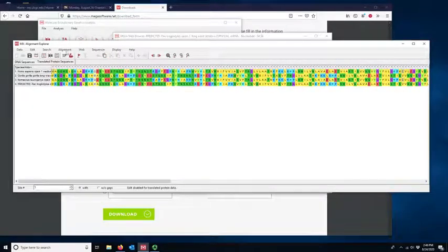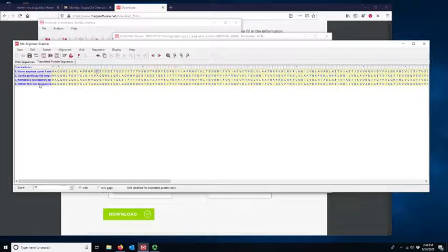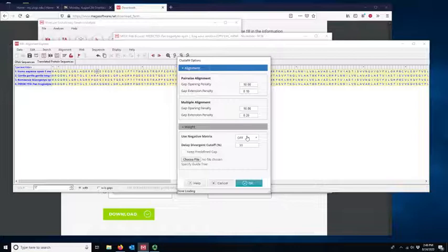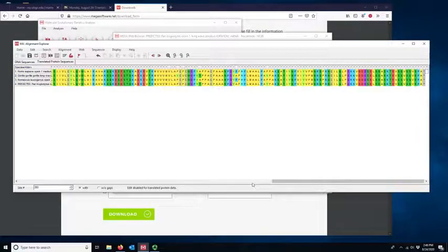You have 2 options for aligning. And we'll talk about alignment later, but we'll use clustal, which is that little W. You could also use muscle. Either one will be fine. Align them at the protein view. Oh, and I need to select them. So we'll select all of them. And then I'm going to align them at the protein level. You can leave all of the alignment parameters at default, and push OK.